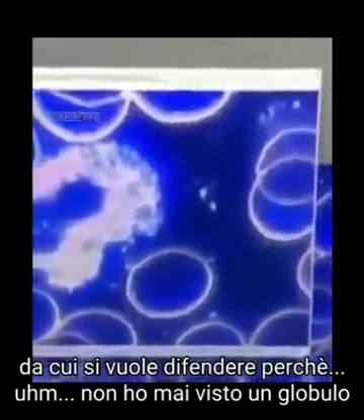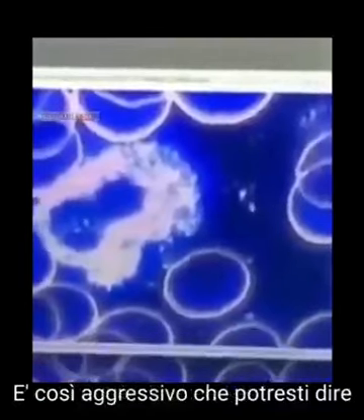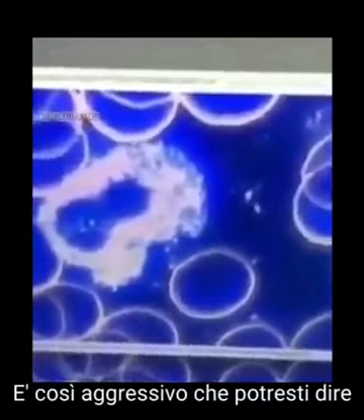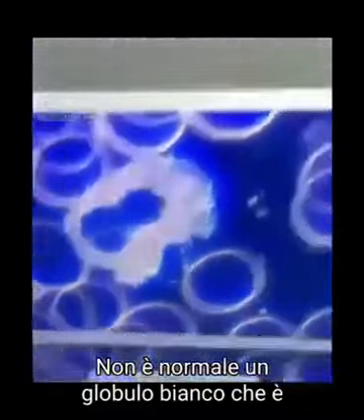I have never seen a white blood cell like this, so for me it was like, wow, what's this? Why is this so aggressively working? Right. You could say if an autoimmune activity or something goes on, this cell is attacking something very strong. So it was not a normal white blood cell which we saw here.